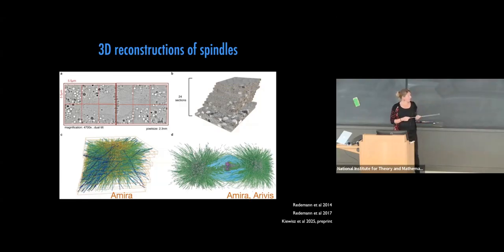And I think there's now a cloud service that allows you to train a network to at least segment chromosomes and other features. But you can see that here too, we're still a little limited in how we stitch our data. And I think it would be amazing if we had the possibility to segment everything else, right? Because you can see the spindle is here, but there's a lot of other stuff that's around. And I think it would be great if we had a way to segment this and also quantify it all together and how things are related with each other.